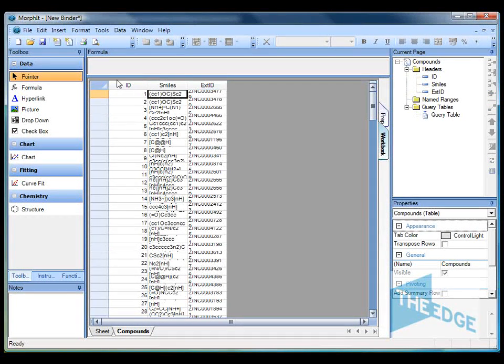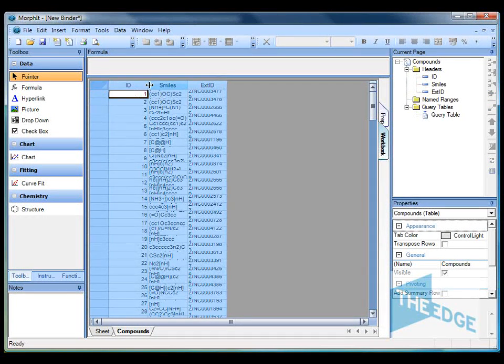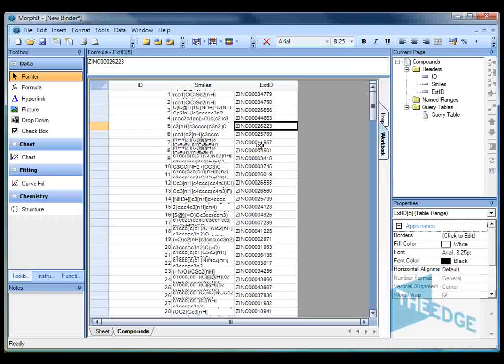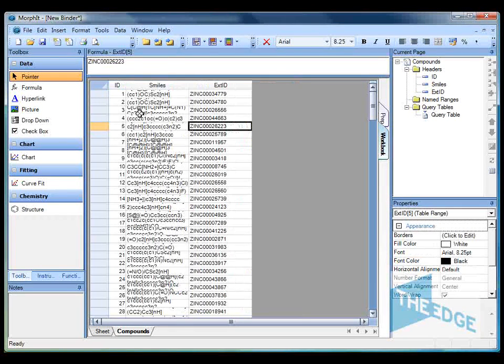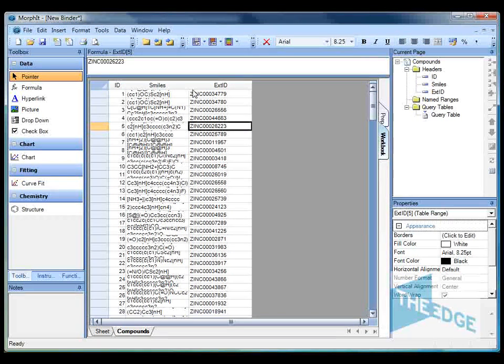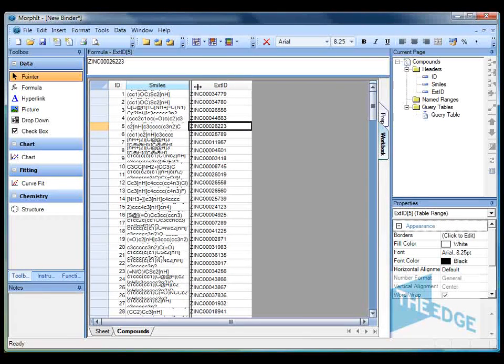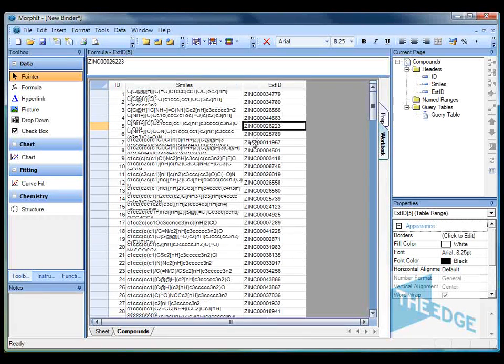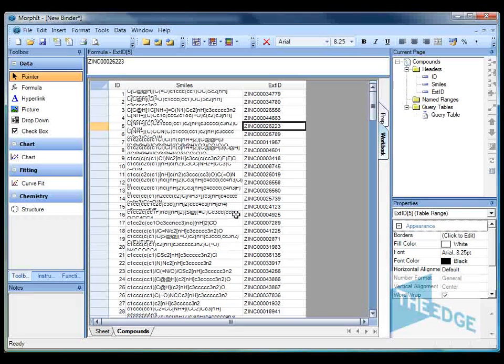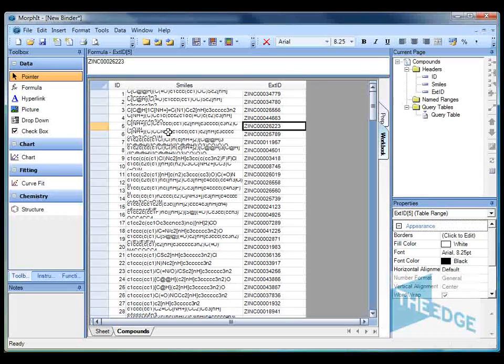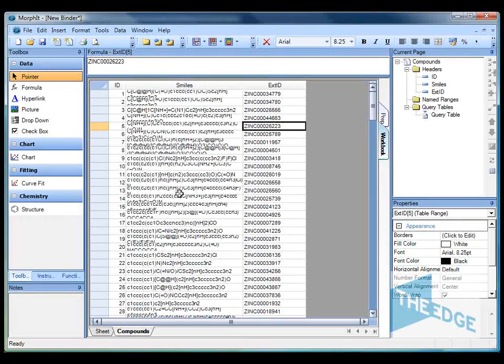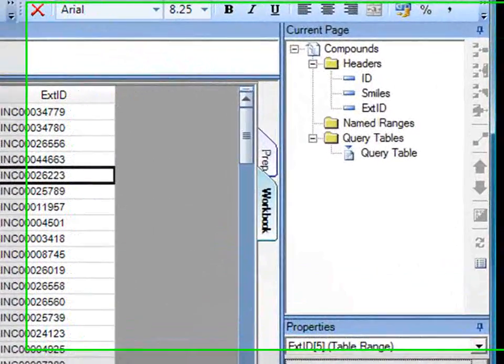So we can see now we have our three columns. We've got our first column with the identifier. We then have our smiles column and then our external identifier. So first of all let's use the structure plug-in in order to visualize these smiles codes as chemical structures so we're going to recognize what structures they are.